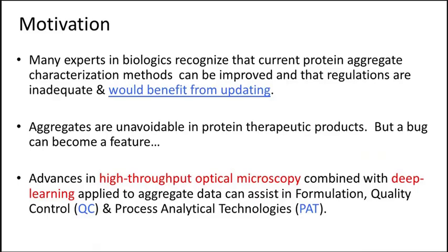And that's what motivated us to actually come up with an automated algorithmic description for being able to distinguish these stress histories and summarize the information content in these flow imaging microscopy images.